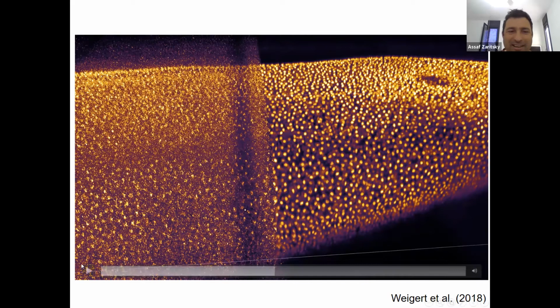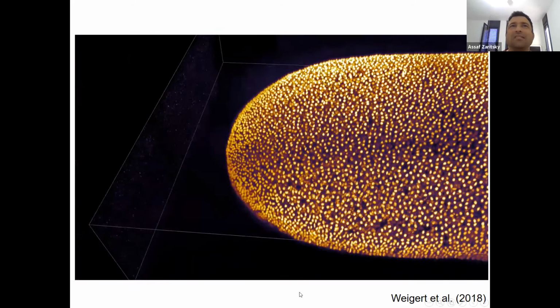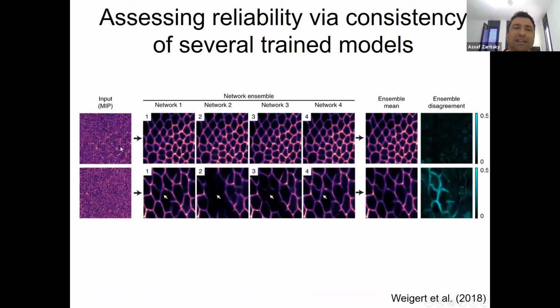Okay. And so I think it's really nice. So it actually does something that the human eye cannot do, right? And you probably notice that also. Look at here. You cannot really distinguish the different cells, but the network can do it pretty easily, pretty accurate.